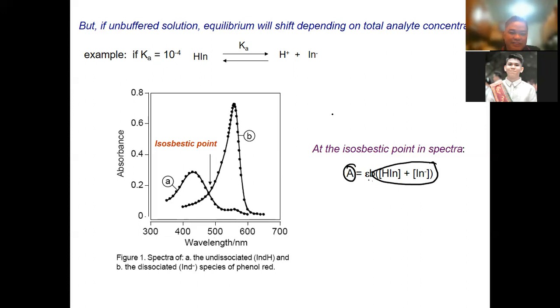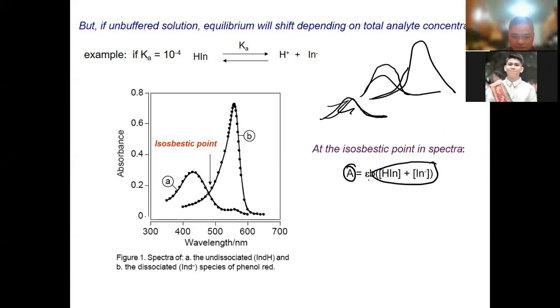So usually you will see this one rising. I think usually that's it. Then it rises. Then when this rises, this one here goes down. So usually in each species that we call solvatochromic, you will always have an isosbestic point, okay, wherein the absorbance doesn't change.